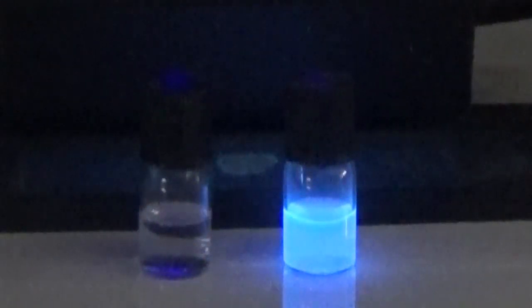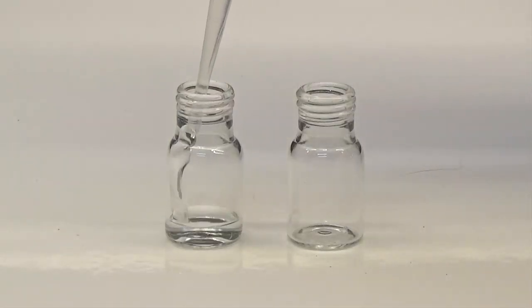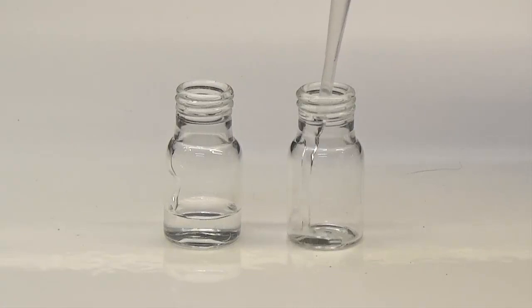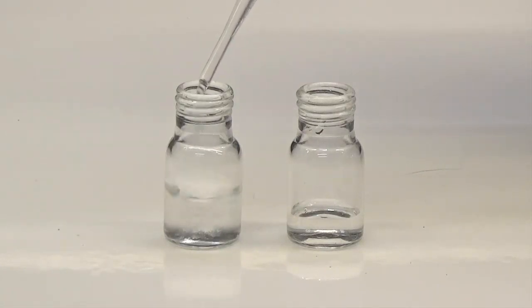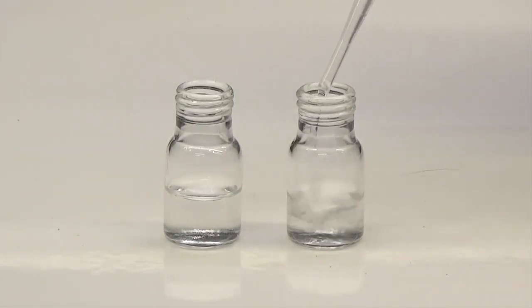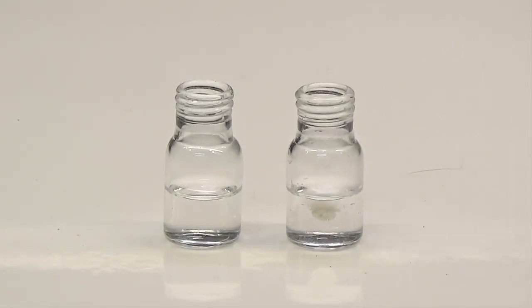Hymecromone fluoresces in solution once irradiated with ultraviolet light. For the test, we mix 1 ml of water and 1 ml of ethanol in 2 vials. In one of these, a small amount of hymecromone is added and agitated to dissolve.